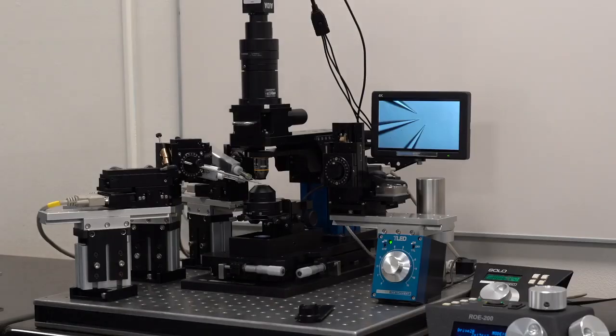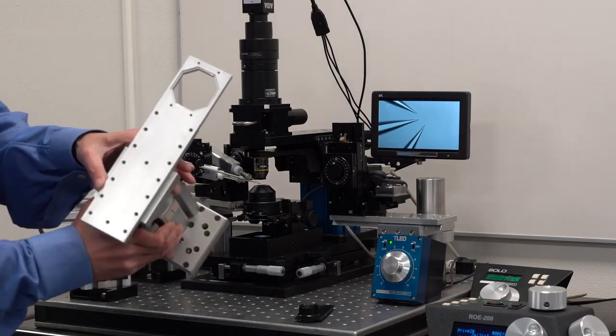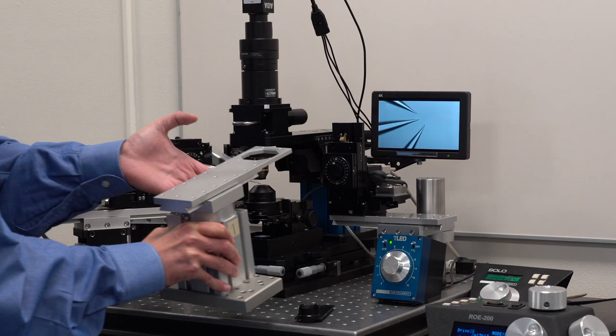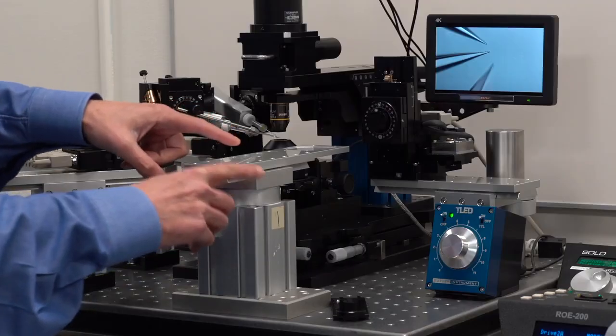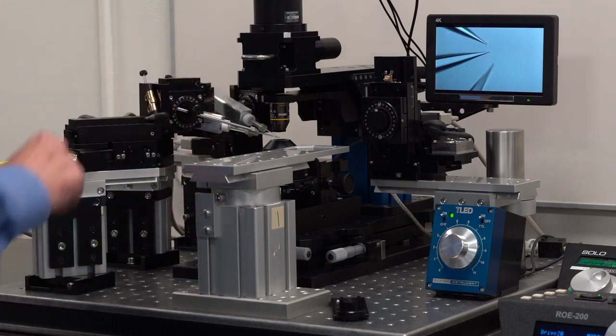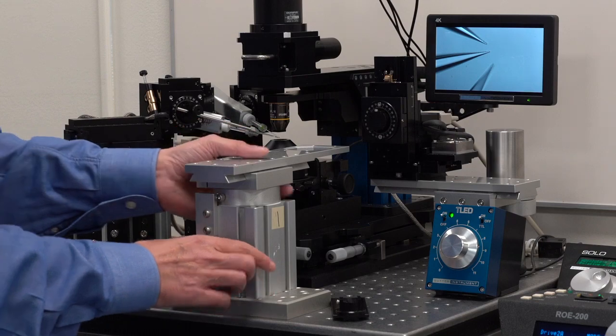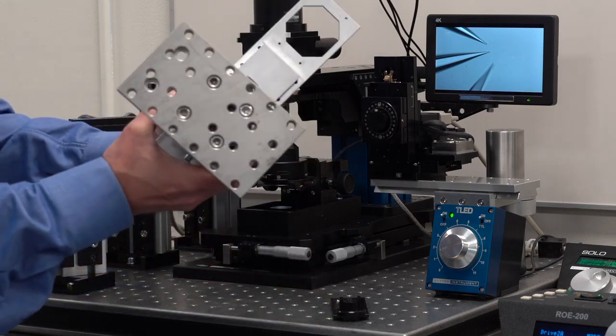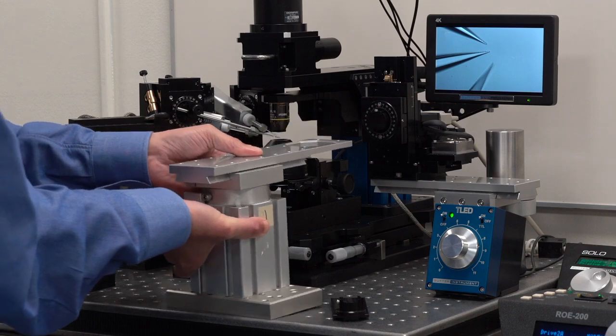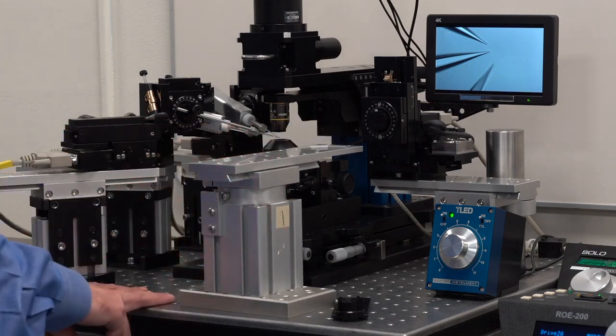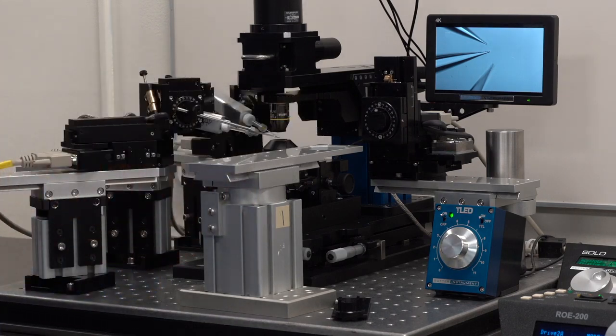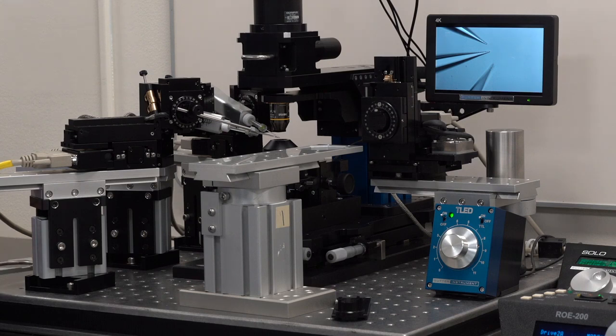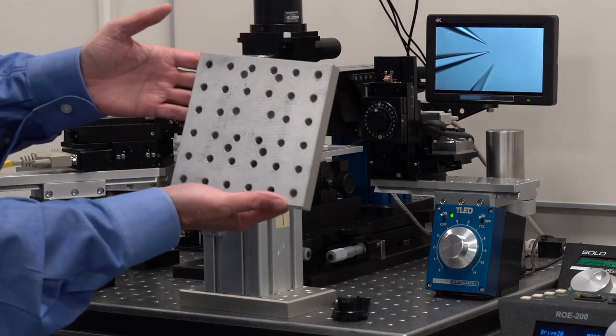The one tower that I have not spoken about is the tower that holds the sample. We make a variety of towers for a variety of different heights. This is the height that works very well with the simple NAND. In this case, I am using a 3x6 baseplate, so it will be narrow, easier to fit on my very limited space here. That is a 3x6 baseplate. The normal baseplate that is most of the time shipped with these things is a 6x6.